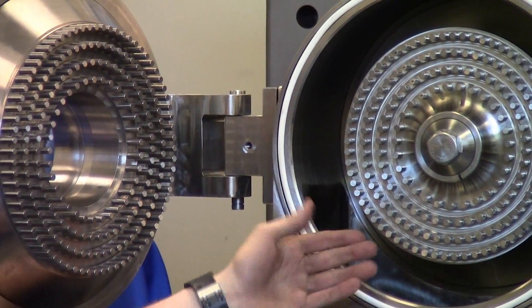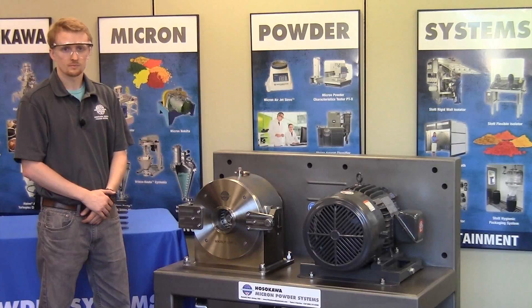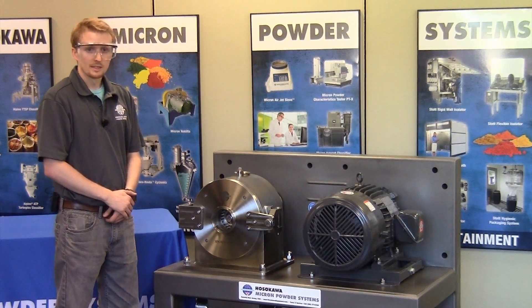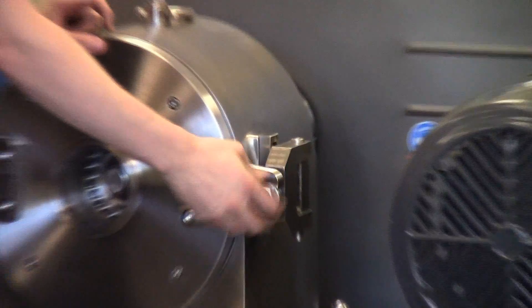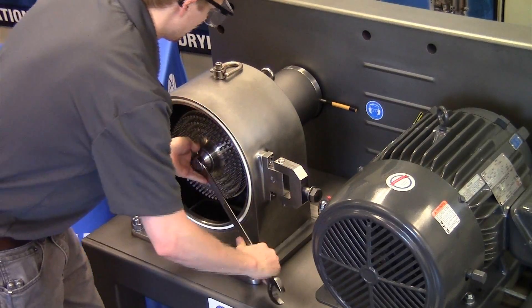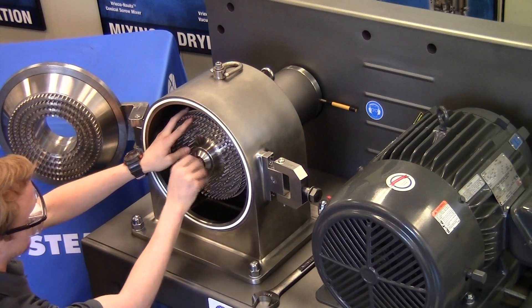After it passes through all of them, it's discharged through the bottom of the mill and conveyed pneumatically to your cyclone or dust collector down the line. The design of this mill is very ergonomic. In keeping with our principles of keeping parts to a minimum and making everything easy to clean, we have single point access from the front with a swing door that allows you to get to the rotors very easily. Our new clamping system here uses no keyway and easily allows for the rotors to be taken off.